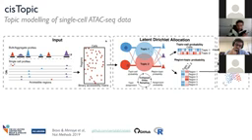But first we have to go through a modeling approach because, as I explained to you in the beginning, this data is very sparse. And to analyze that, Carmen in the lab developed a method called cisTopic that uses topic modeling. This is borrowed from the text mining field. Basically, it's a latent Dirichlet allocation or LDA approach that is going to find topics. These are latent variables, and this is a probabilistic framework. And these topics now represent probability distributions, two of them, that after optimization will have the probability of each region, how much each region likes a topic, and also a probability distribution over the cells, how much each cell likes a topic.